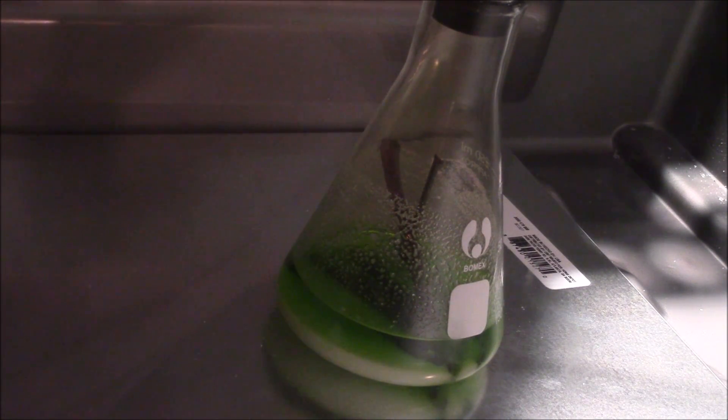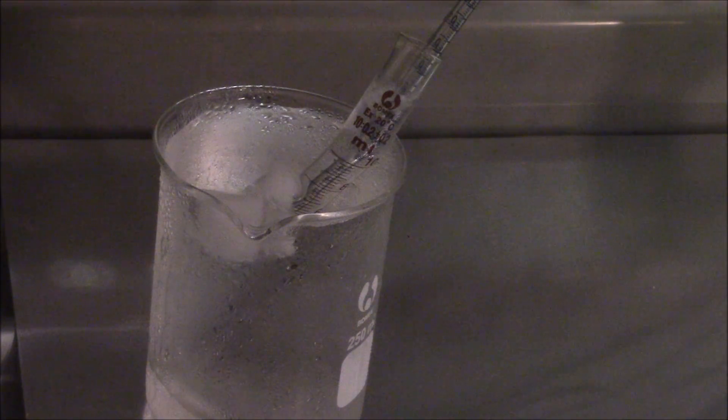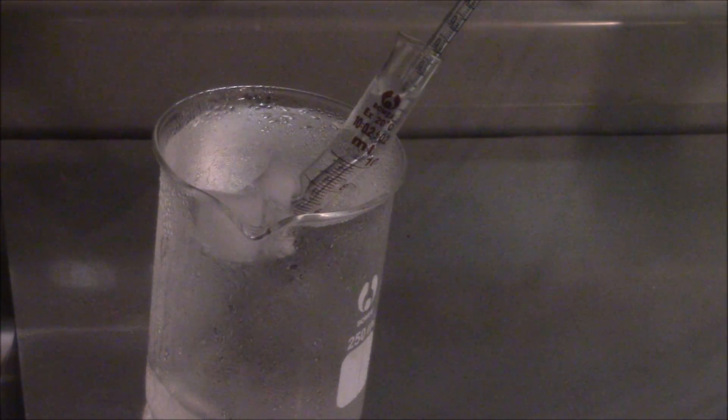We've got our hydrochloric acid, potassium nitrate, copper, and water all mixed together in there, and as you can see it has changed color because it is producing the nitrogen dioxide gas that we need. If we move over to our peroxide, you can see the bubbles of nitrogen dioxide gas going into it and mostly dissolving into it. Of course you get a little bit of escape, but that's why we've got our cold water bath to help some of that nitrogen dioxide dissolve more before it escapes out of the graduated cylinder.